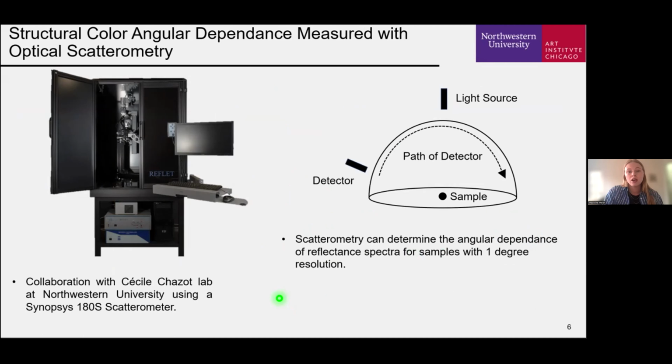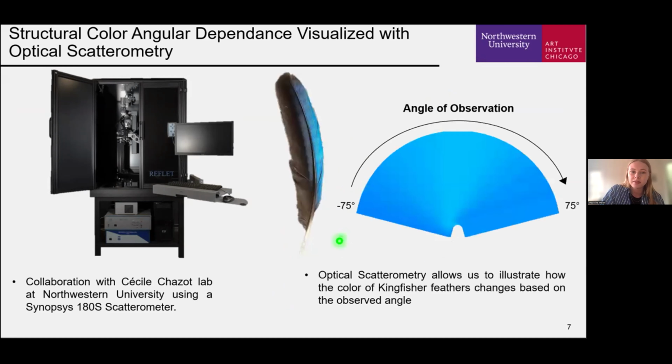Optical scatterometry, or optical goniometry, measures the reflectance spectra of a sample over a range of angular values. As depicted in this schematic here, the detector moves in an arc-like pattern, collecting reflectance spectra with a 1 degree resolution, or sometimes even finer.